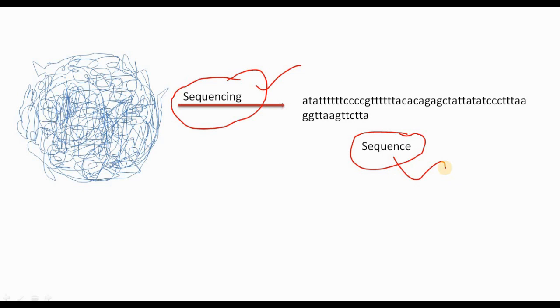So at the end of sequencing, you will obtain a long stretch of nucleotide arrangement data. This could tell you the nature and position of nucleotides in the DNA that we have provided to the sequencer machine for sequencing purposes. See, two things. What you need is a biological organism which is acting as the source of DNA. From the organism, you have to isolate the DNA by adopting a suitable procedure. After isolation of DNA, the DNA is purified. After purification, it is sequenced. After the sequencing procedure, you have identified the nucleotide composition of the DNA sequence, right?